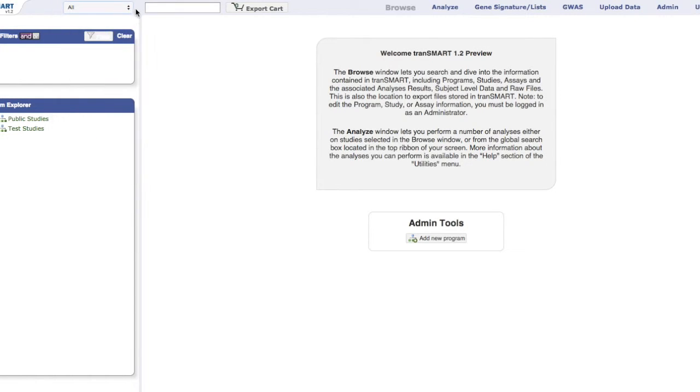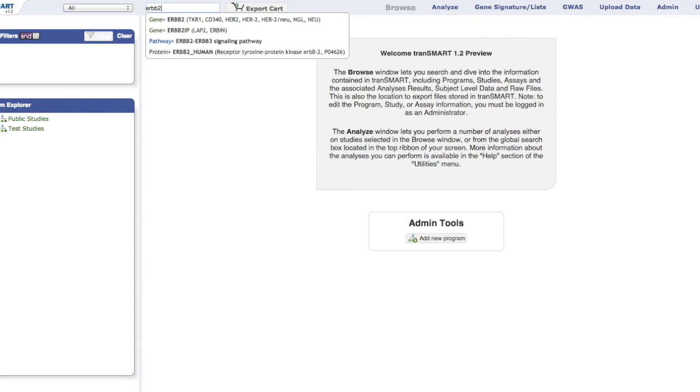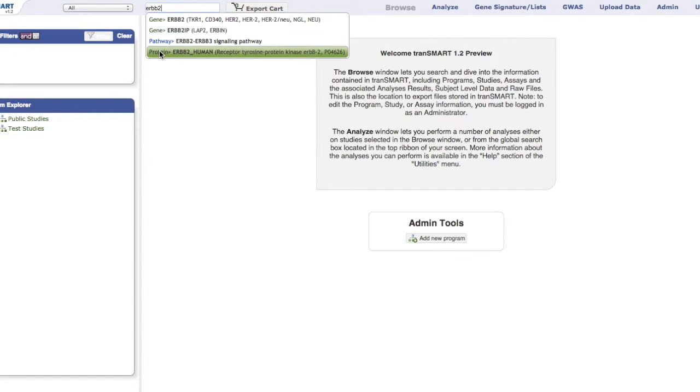In this example, ERBB2 is the term used. Notice that automatically the system provides results in the drop-down: the ERBB2 gene, pathway, and protein.